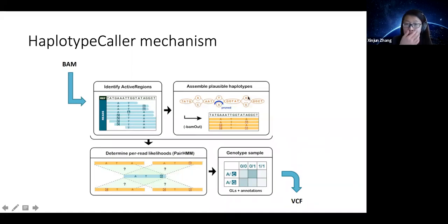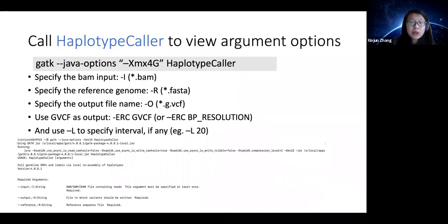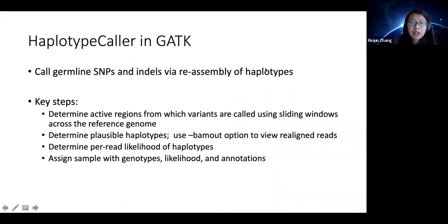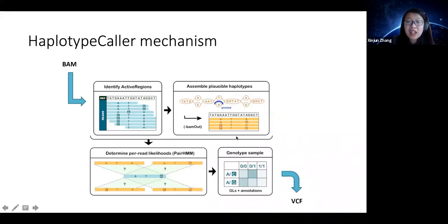For example, if you have some reads here with a lot of indels, the reads may look not well covered for such a region. So haplotype caller would automatically reassemble these reads if necessary. To figure out which regions are being reassembled, we are going to specify in our function, when we're calling haplotype caller, a -bamout option, and it's going to generate a new BAM file.